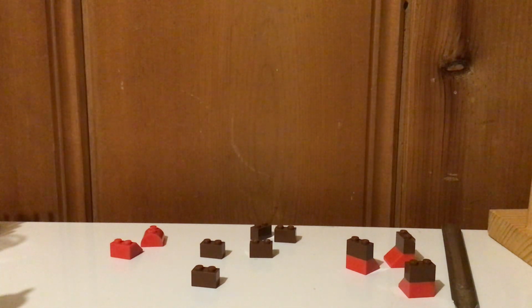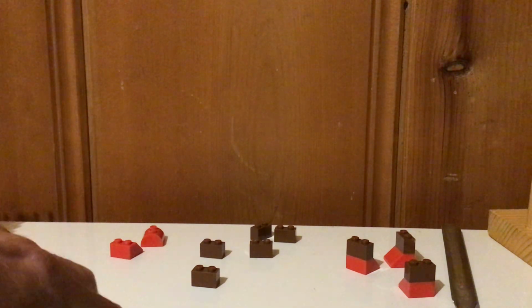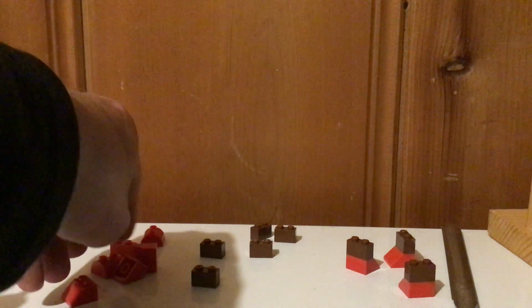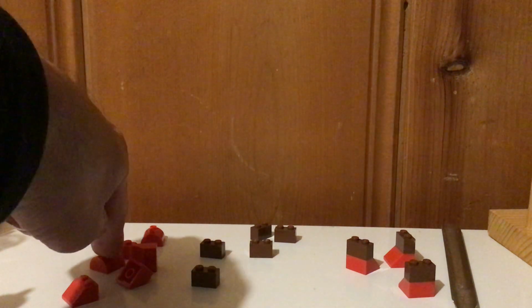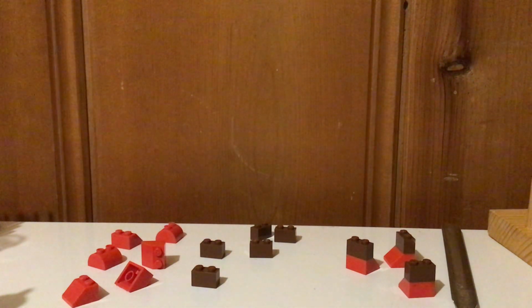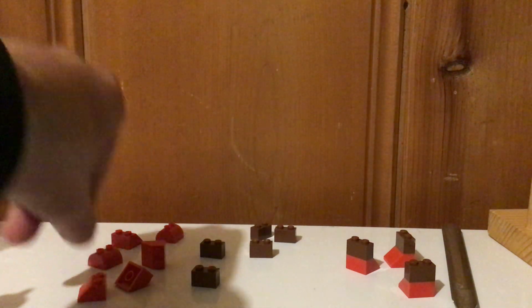So now we're going to apply a shock to this equilibrium system. Okay? And this is all in balance, but now I'm going to throw a bunch of Fe plus 3 into the system. And the system's going to be wanting to try to get rid of it. So I threw a bunch of these in here, and the system goes, oh, too much Fe plus 3, I'm going to try to get rid of it. Just like if you won the lottery, oh, too much money, okay, and the government would come and help you out by taxing you on some of those earnings, because that would be too much money for you, and then they can help establish equilibrium in the markets.